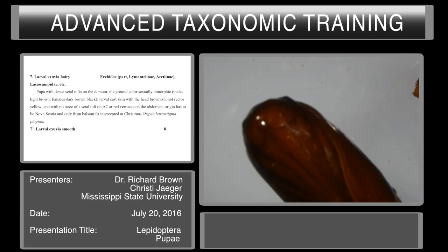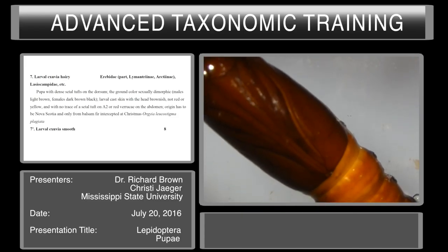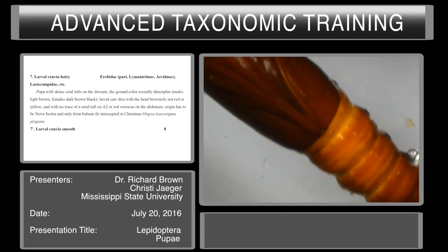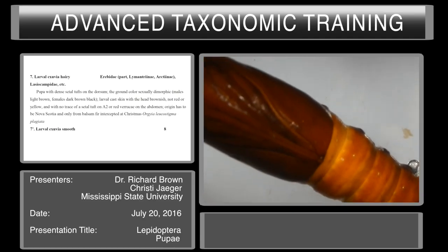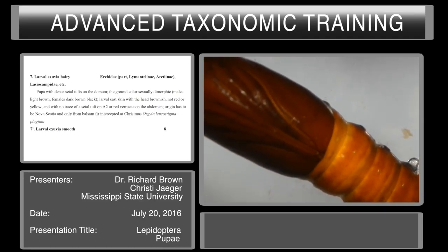Couplet seven is easy: larval exuvia hairy, which would mean the Erebidae, or larval exuvia smooth. This pupa is smooth and there is no hairy larval exuvia associated with it. So we go to couplet eight.